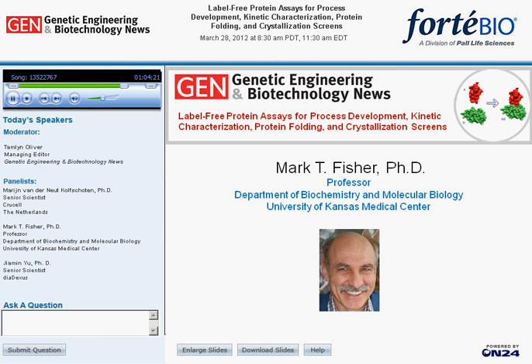Also, it turns out we can immobilize the chaperone on the tip and interrogate the protein directly in solution. So that problem is avoided in that particular case, where you would have a change in the native conformation of the protein. That's always a concern, and that's a very good question, and that's one of the reasons why we have two different configurations that we use.